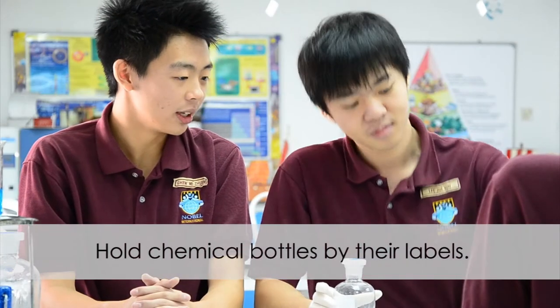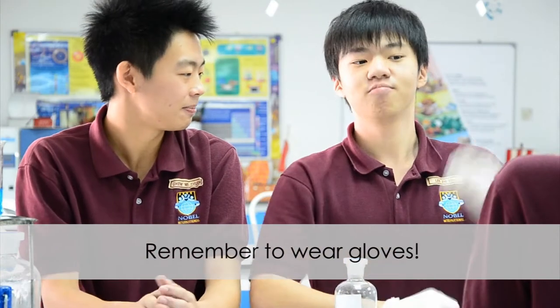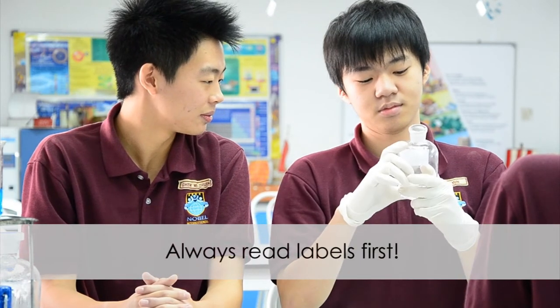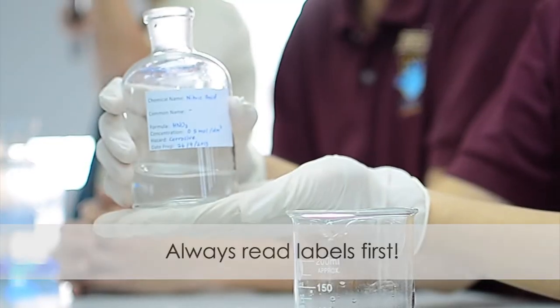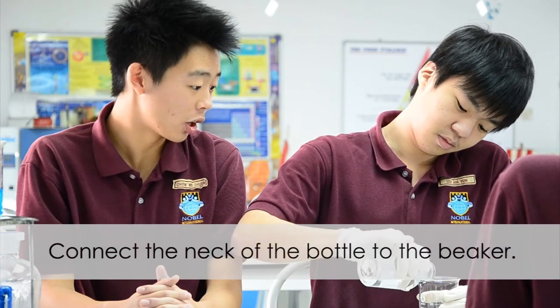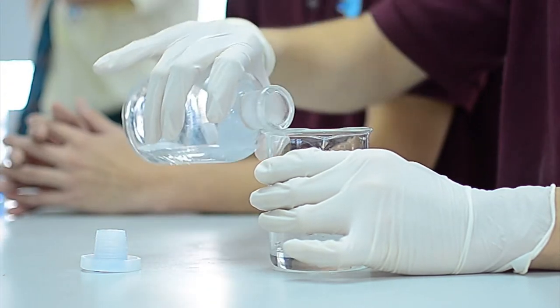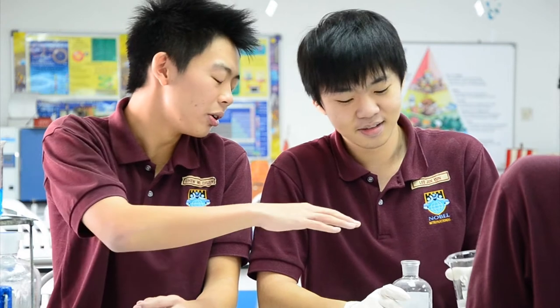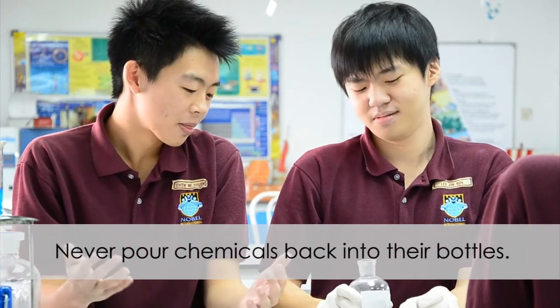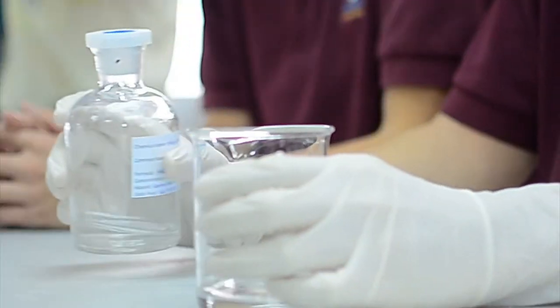Read and hold the label. Wear gloves. Okay, read the label. To avoid spillage, connect the neck onto the top of the beaker. Oh no, I poured too much. Do not ever pour it back — because it causes contamination if you pour it back.